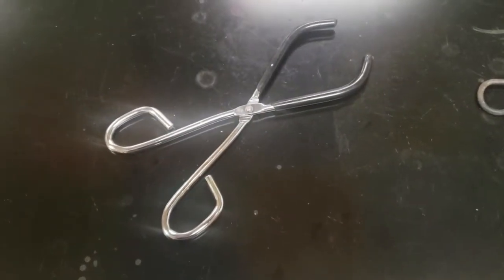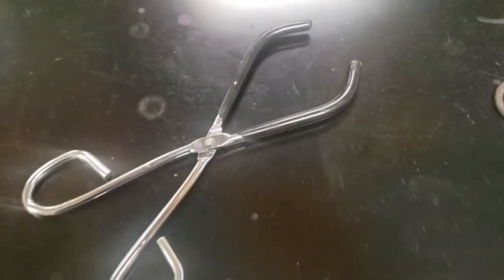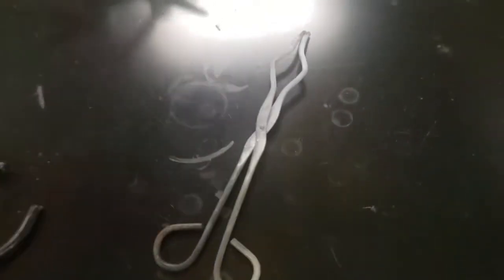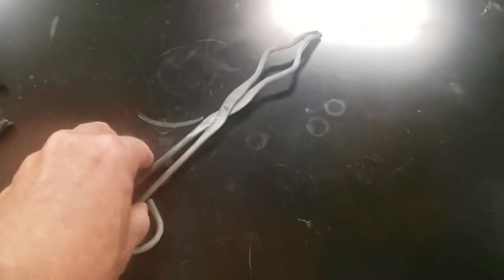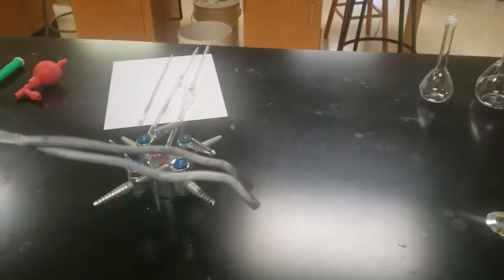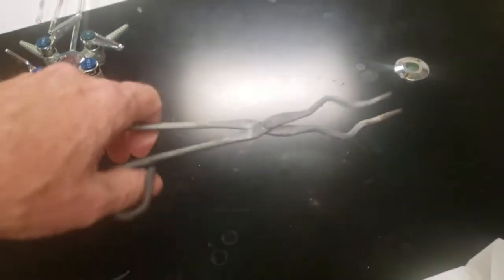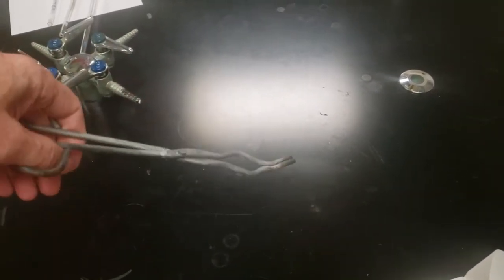This is a beaker tong. The beaker tongs contain plastic on the end, so you don't have the metal on glass. It also means you can't heat them up very high or they start smoking and burning. This is a very useful tool. It's just tongs. They kind of bend down when you do it right. If you turn it upside down, it's really kind of awkward. But we use tongs a lot. Just got to be careful about transferring things.